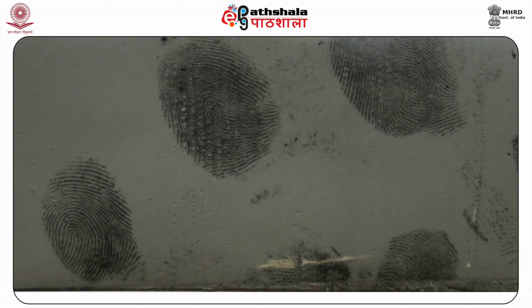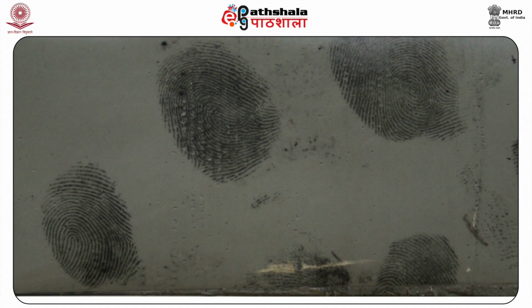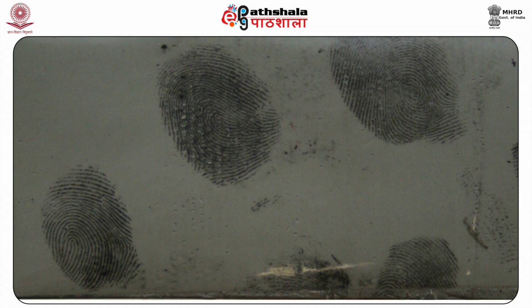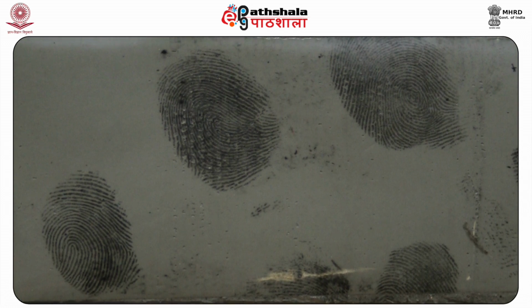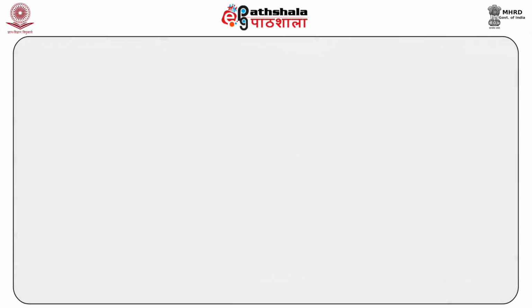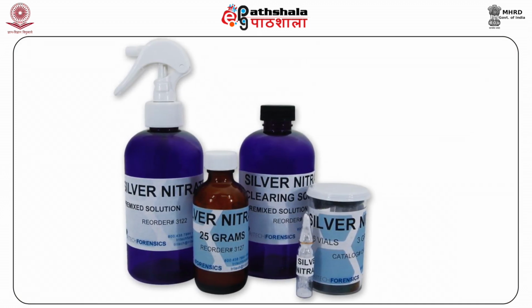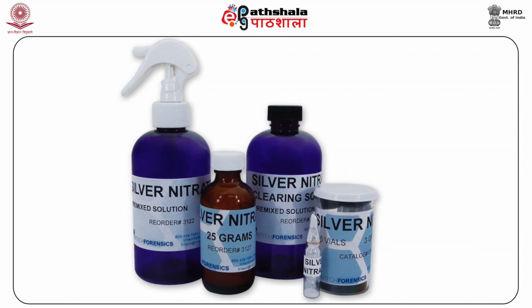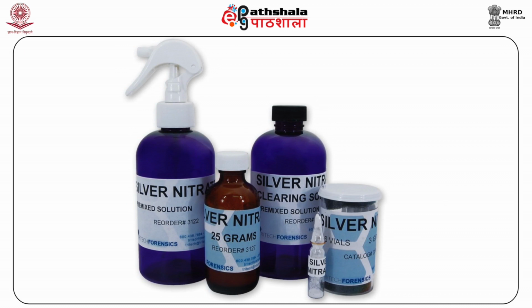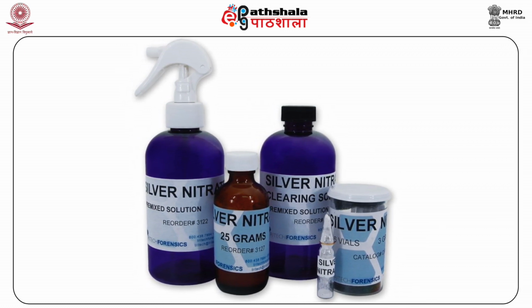The physical developer technique is a means to detect fingerprints on porous items, including paper articles, clay based products, and adhesive tapes. One of the ingredients of the physical developer composition is silver nitrate, which during processing of fingerprints is reduced to finely divided metallic silver.